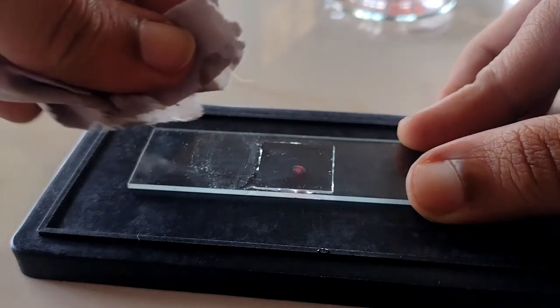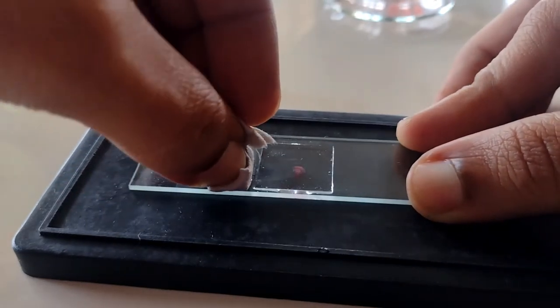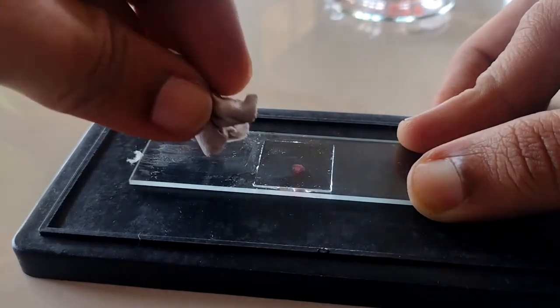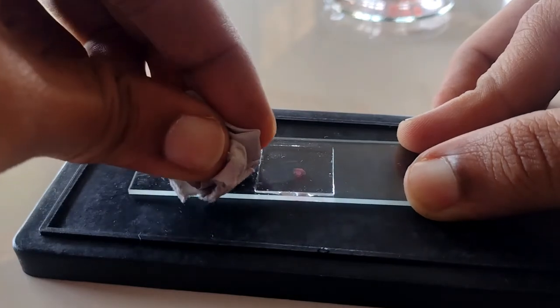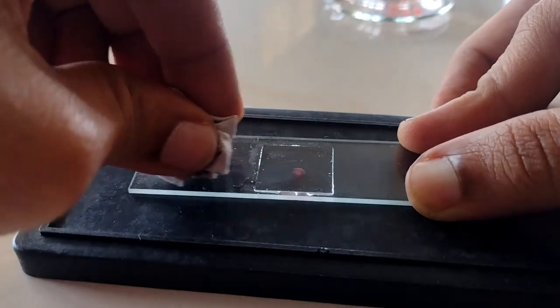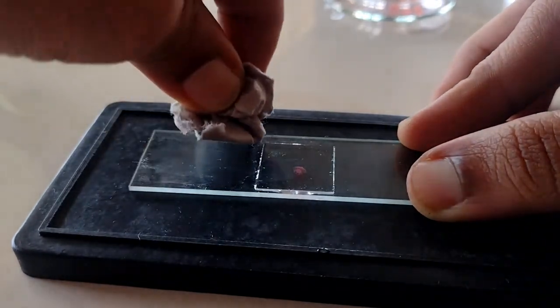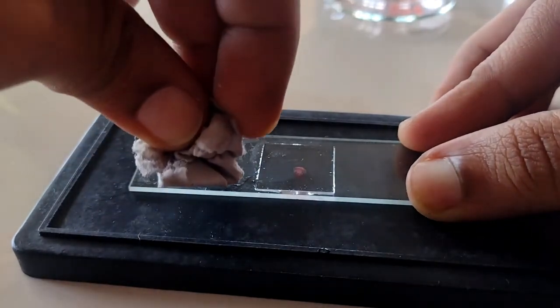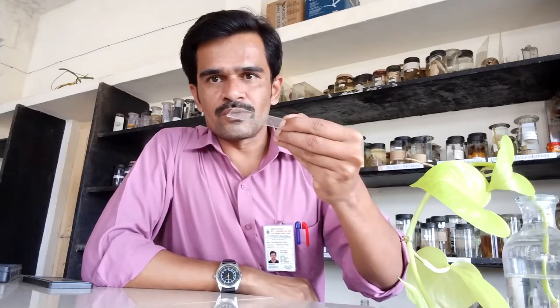Now I am cleaning the slide. Always prepare a clean slide so that when you show the slide to the examiner, they will be impressed by seeing only the slide with the naked eye, without any microscope. The slide of the transverse section of plant material is now complete.